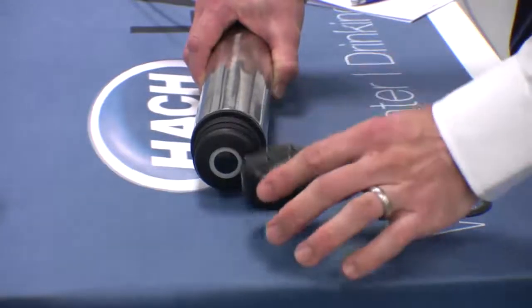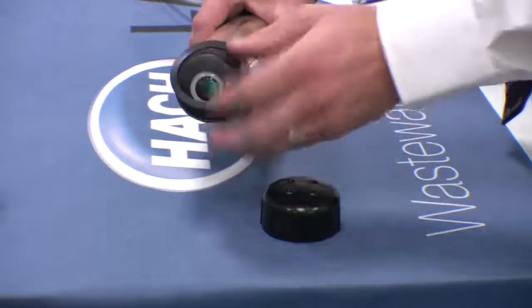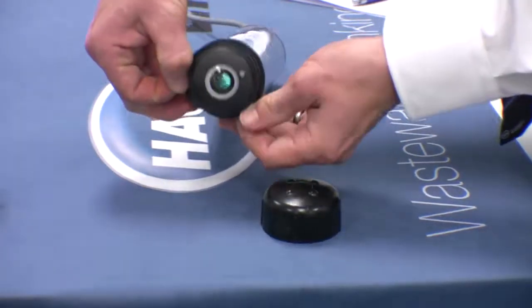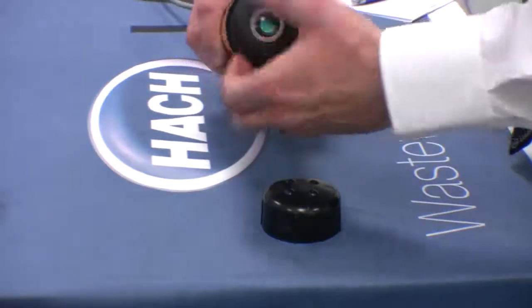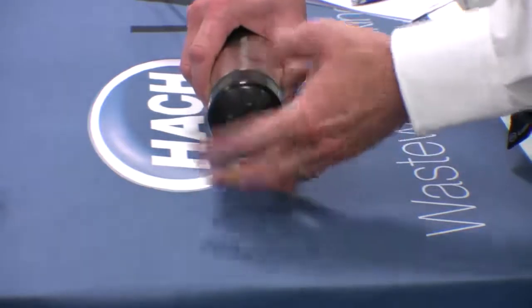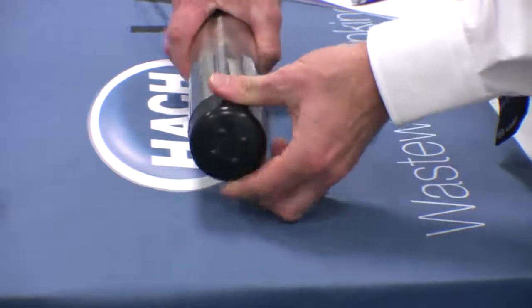When you order a new cap, you will receive both the cap and the new sealing ring. The sealing ring sits in the sealing groove and therefore you must ensure that the sealing groove is cleaned and free of debris to ensure a good fit. Place the sealing ring in its groove, then fit and hand-tighten the sensor cap.